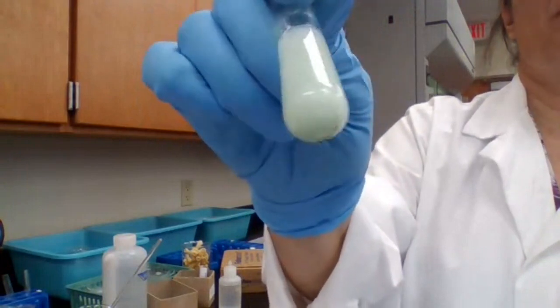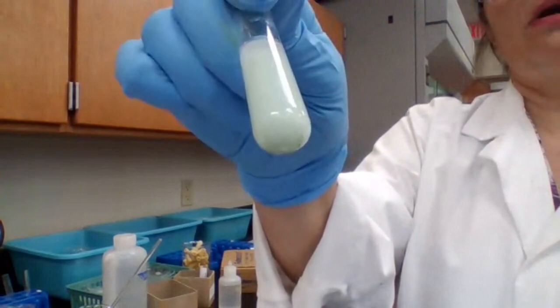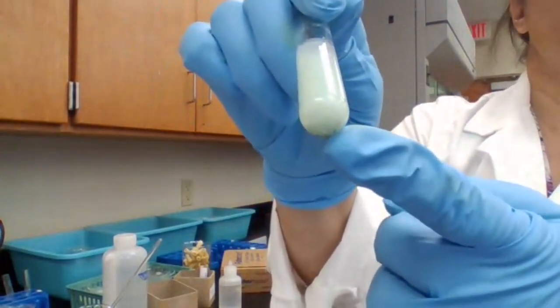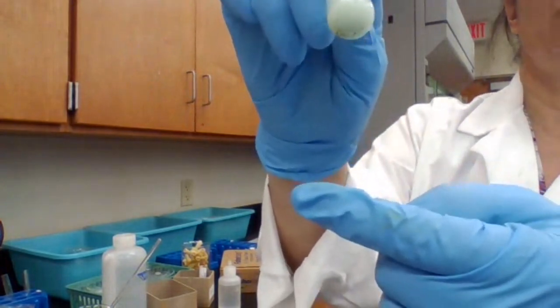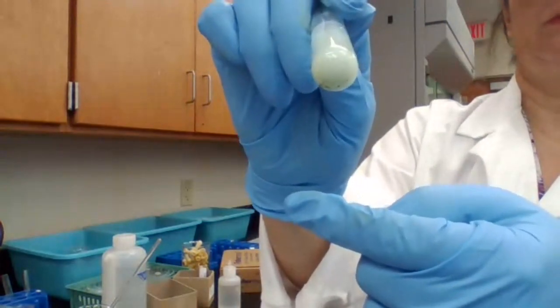The black particles with the white precipitate you have can give you a gray color, but this is the evidence. If you see even 2 or 3 of them, but I see a lot right now, that is evidence for presence of bismuth. So make sure you record it.